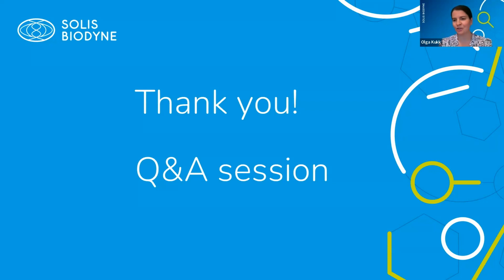Okay, for now, I think that should be it. Oh, we have just one last. Let's take the last one from Q&A, which just popped up. Xander is asking, hi, SolisGreen versus EvaGreen. Can you say something about the sensitivity and specificity of these products compared to each other? And which would you recommend?